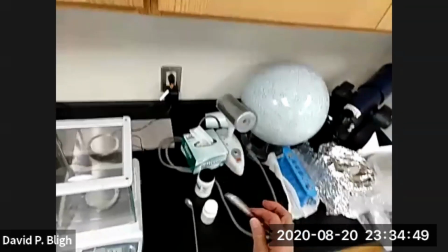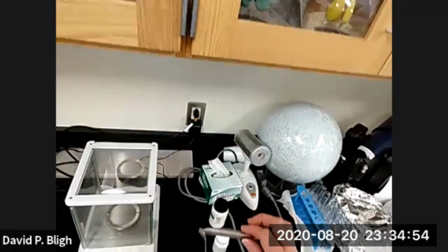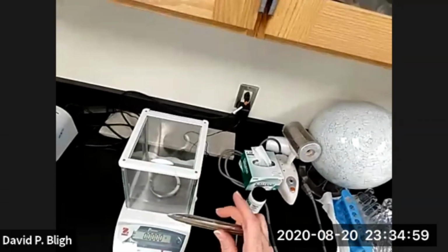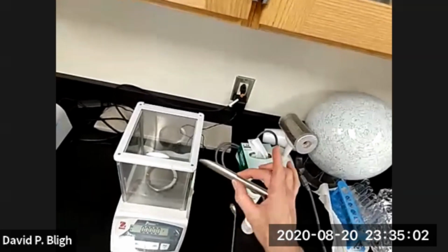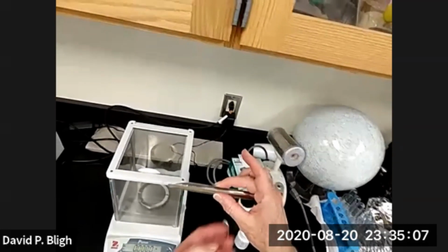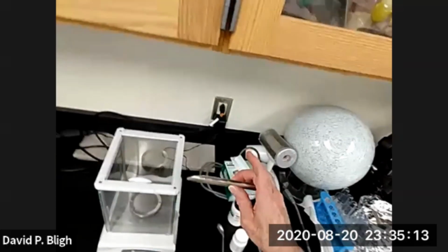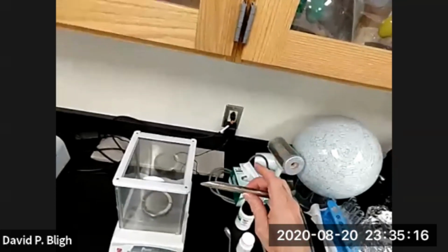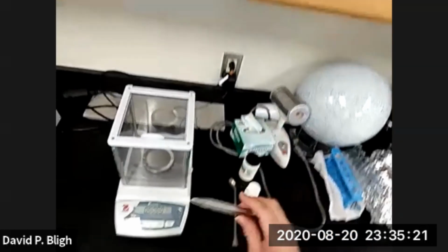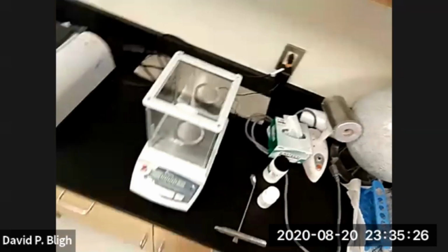And the way you hold it for delivering controlled amounts of your substance is kind of like chopsticks. You have these fingers holding your middle finger and your thumb holding in the middle of the spatula, and then you rest the back of the spatula in the crook of one of your other fingers, and that stabilizes it. And then to deliver, all you have to do is tap with your index finger, right? So that's called controlled spatula. Okay.